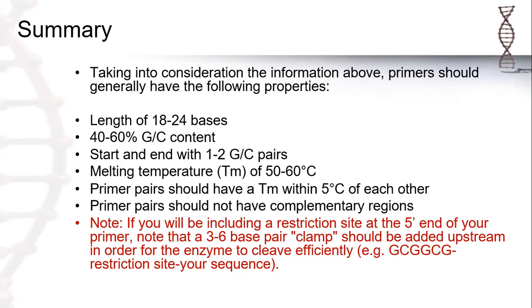For example, first the length of the primer should be 18 to 24 bases. If you have the total sequence of the DNA sample, you can count the number of bases from the start for the forward and reverse primer, and that should be optimally 18 to 24 bases. We can also allow a maximum of 30 base pairs.